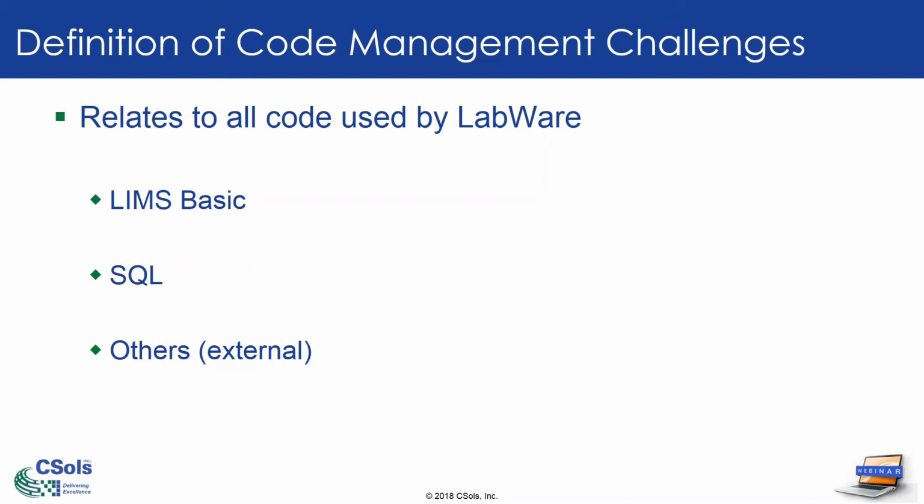But in addition to the LIMS Basic, it could be that direct database interfacing. So you could have SQL queries where you're inputting or outputting information directly from your database. That's quite common. But also any other external languages or scripting languages, command line, JavaScript, which is used now especially in the visual workflows for LabWare. So there's a lot of different languages. So it's really anything that you're currently using in your LIMS instance is what we're talking about managing here today.